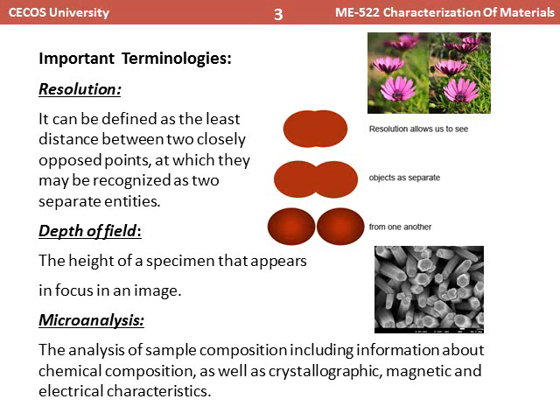This structure is made of iron, gold, or oxides like cerium oxide, magnesium oxide, calcium oxide, whatever it is, and how these structures are arranged in this object. We can also analyze that by the microanalysis tool.